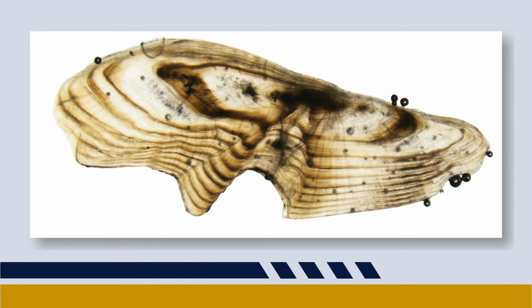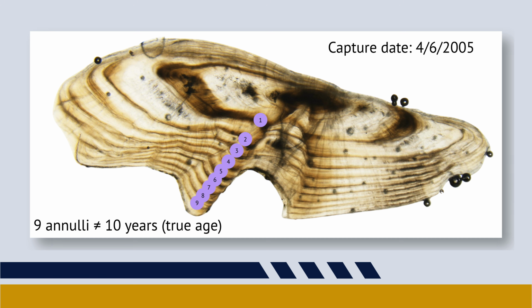The last annulus is the most critical. The edge records the fish's newest growth, so the ring count alone may not equal the assigned age. Check the capture date, the edge type, and the validated timing of annulus formation for that species and stock. A fish caught early in the formation period may not yet show a completed new annulus.